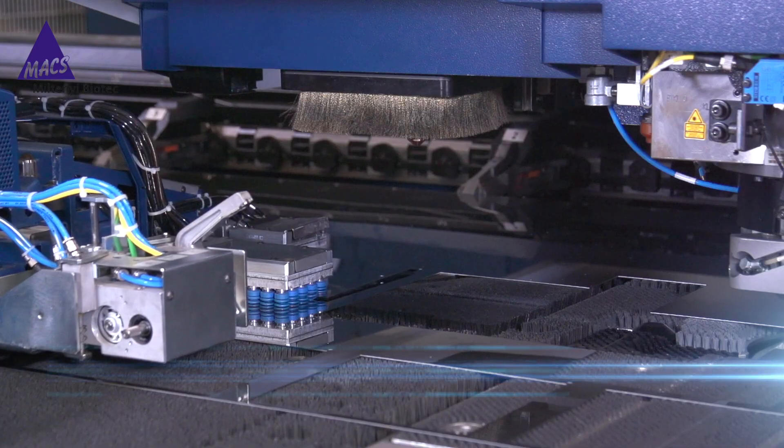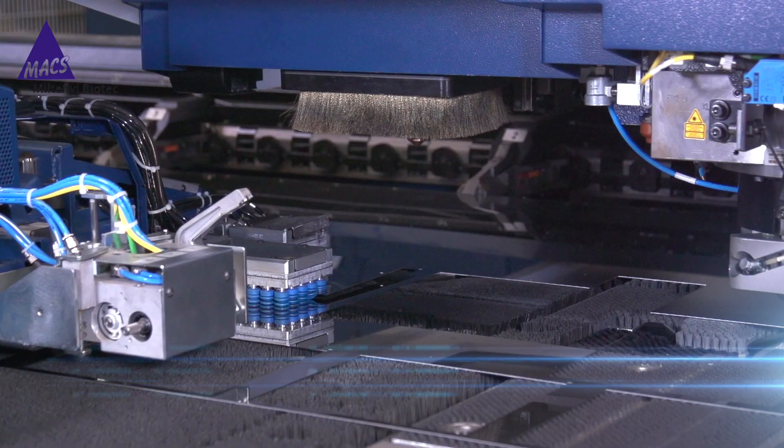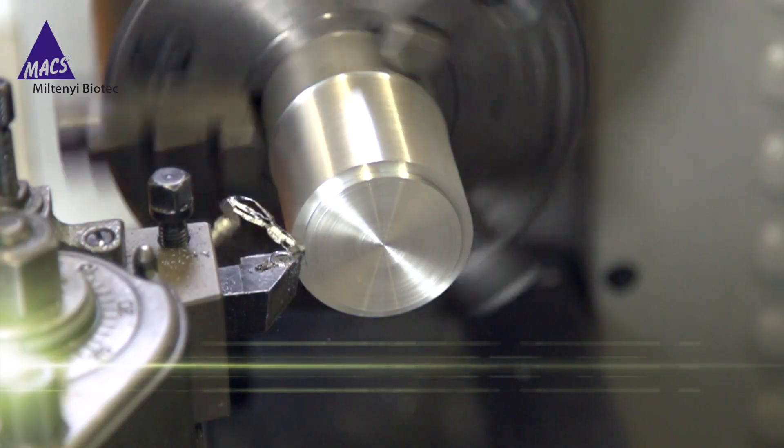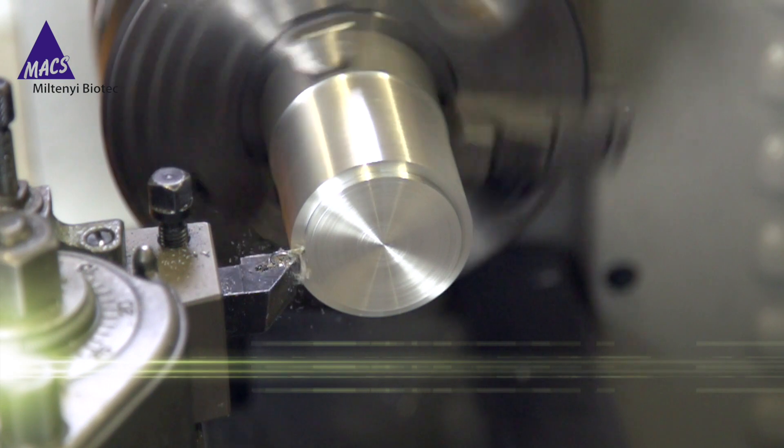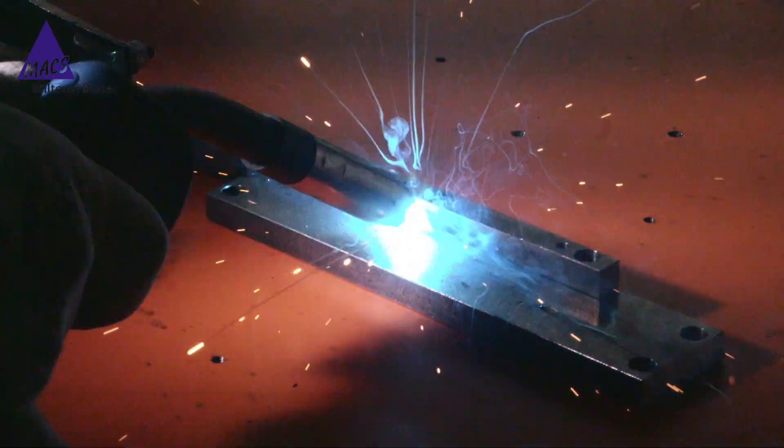But what if there was something? An instrument with a different approach to flexibility, to usability, designed to be the fastest, not simply for bragging rights, but for clear purpose.